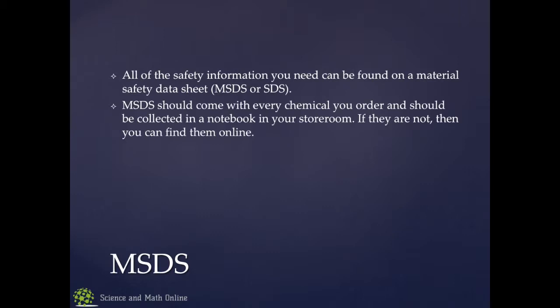They should be kept in a notebook in your storeroom. If you have inherited a storeroom where they don't have these, then as you use chemicals, look them up, print them out, and put them in a notebook. If you have time to print out sheets for everything in your storeroom, that would be preferable. But if you don't, then every time you use a chemical in a lab or in a demo, look up the material safety data sheet, print it out, and put it in a notebook in alphabetical order.